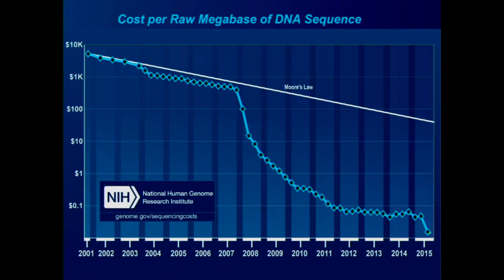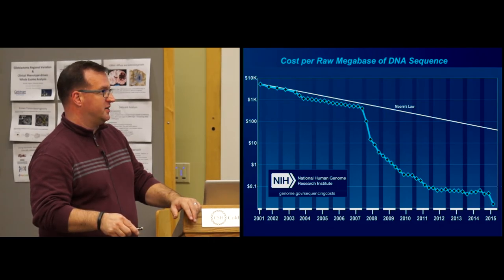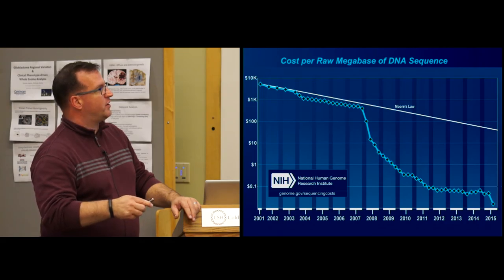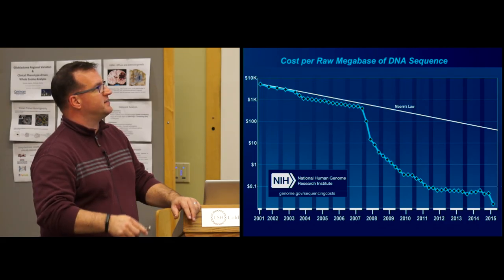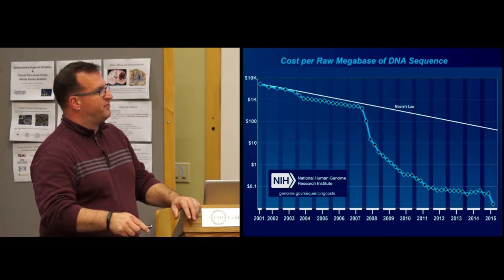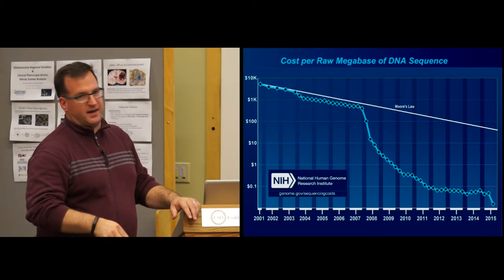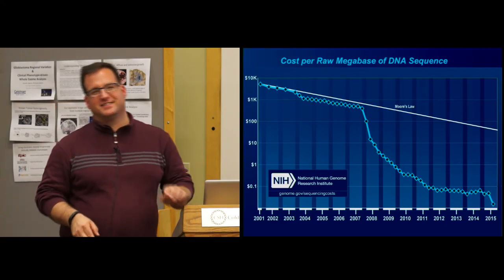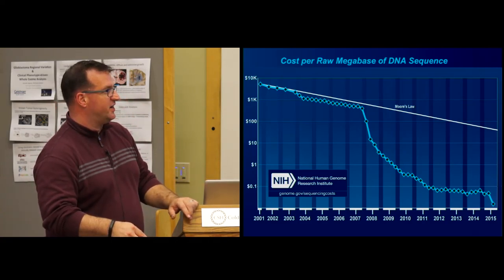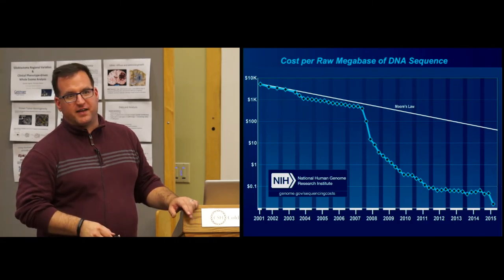But now look, 2015: Oxford Nanopore and PacBio, and also Illumina continuing to be driven in their pricing wars, we're going to start going down again. I don't know whether we're going to get the slope that we got there, because that was pretty exciting, but something in the middle. My former pessimism, which you've never heard, but some of the lecturers have heard, has now been erased by this one dot. So we'll see next year. Come back next year, pay the big money to come back one more time, so you can see whether it goes here or whether that was just an anomaly and we go back to a flat curve.